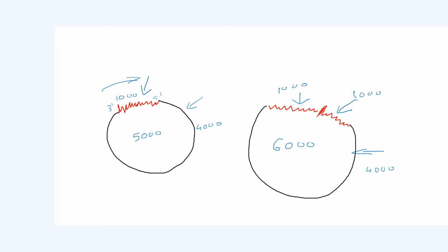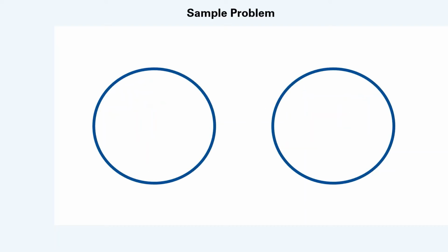And therefore plasmid mapping has a very high importance in cloning, because you want to verify that the product you get after inserting the gene of interest into the plasmid is the correct product. So that evaluation requires you to do the plasmid mapping. So on this slide, let's talk about what happens with the plasmid mapping.